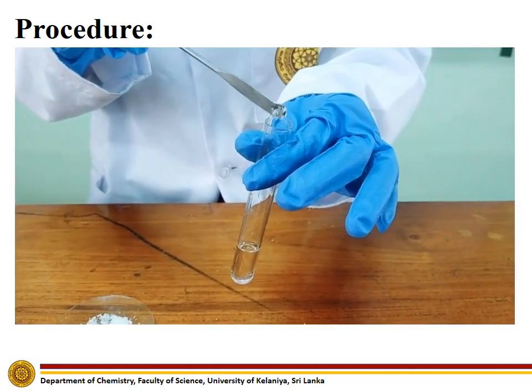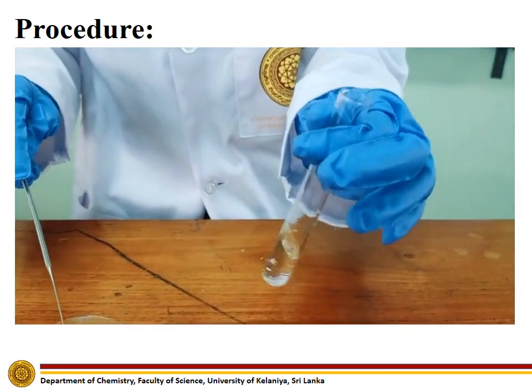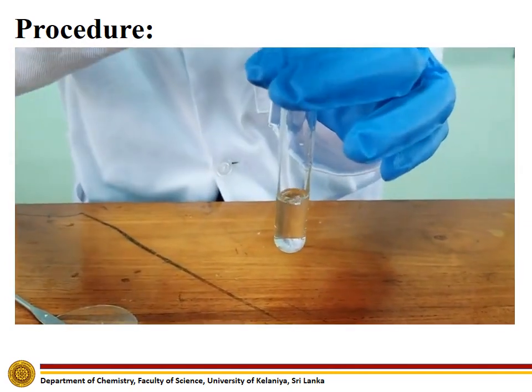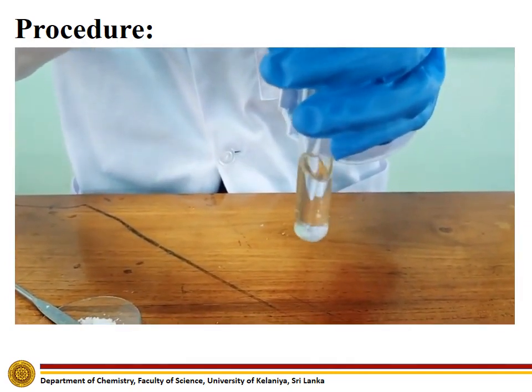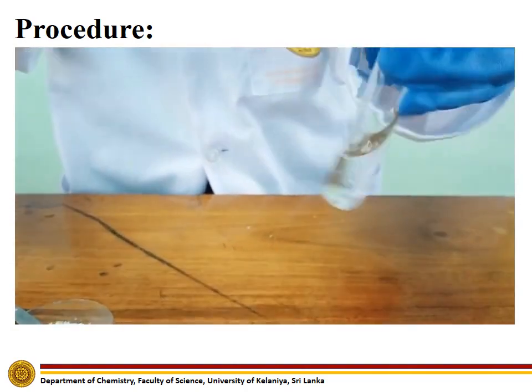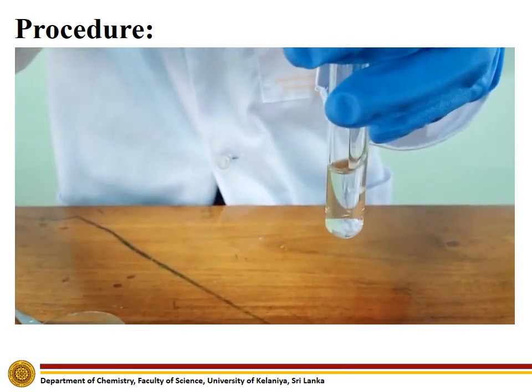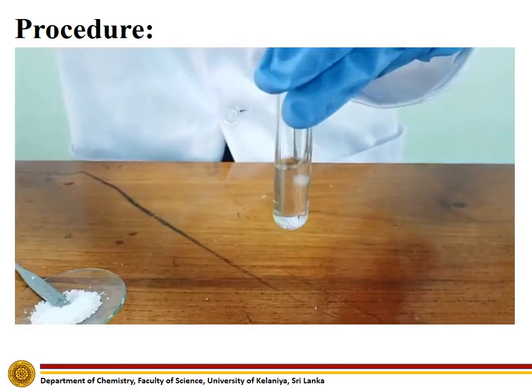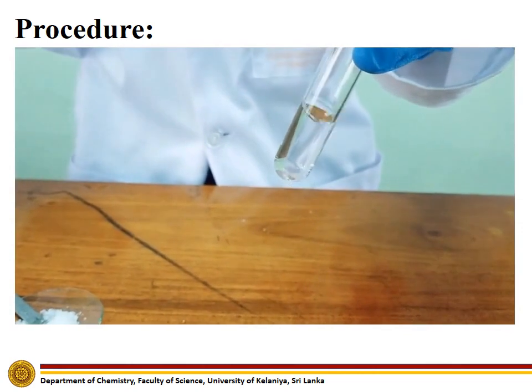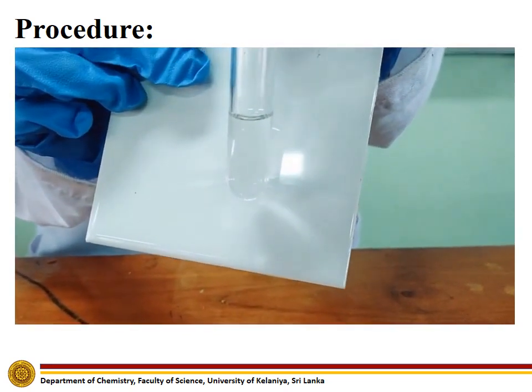To carry out the second experiment, add benzoic acid to a test tube containing dilute sodium hydroxide and observe whether a clear solution is obtained. After benzoic acid is dissolved completely, a clear solution can be seen.